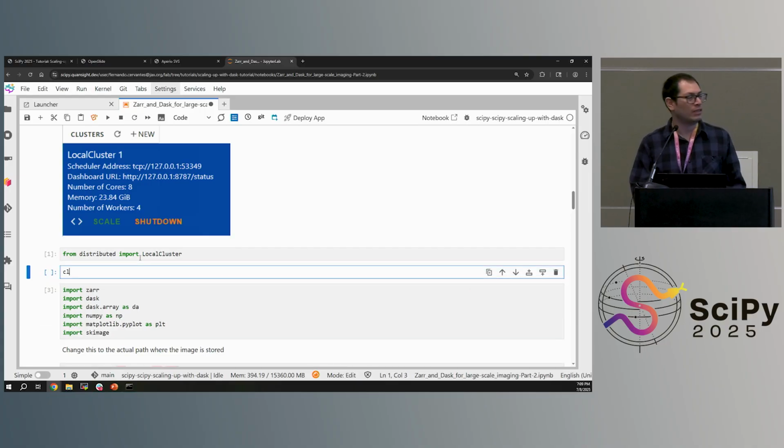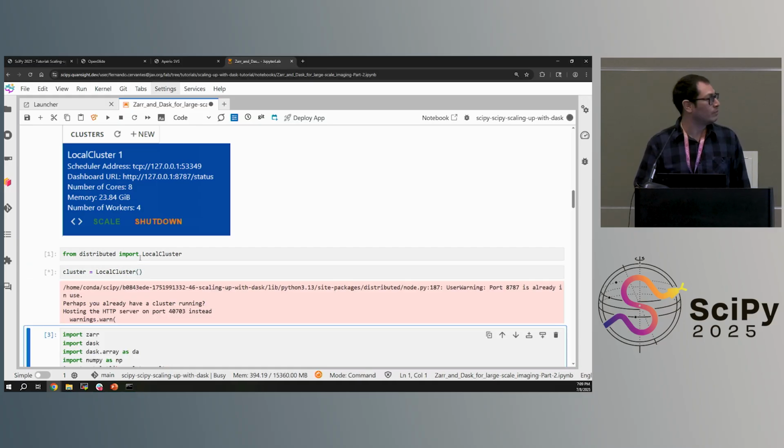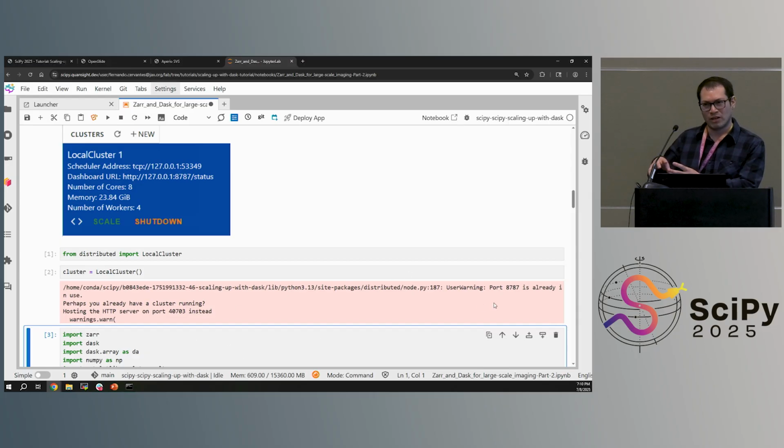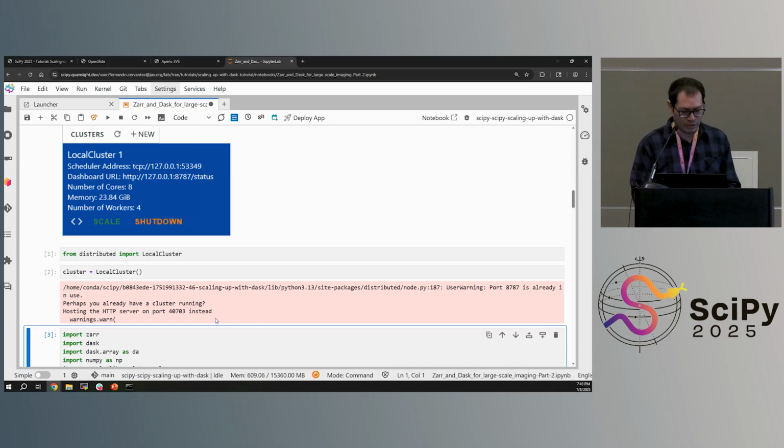You may notice that there are also 2 singleton dimensions, and that's because it's in the OME metadata standard, where you always have a T dimension, a Z dimension, a channels dimension, and X and Y. Because of that, it has those 2 singletons. It doesn't actually have any time or Z dimension. And then there is a third part, related to what Peter mentioned: now the color axis is in the front. If you open the image file, I think it is in the trailing axis. In this case, it's moved to the first part. But we can solve some of those issues.